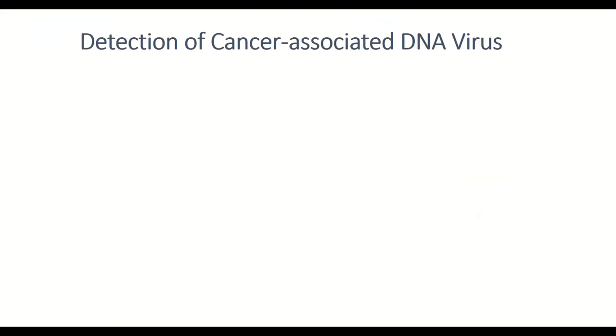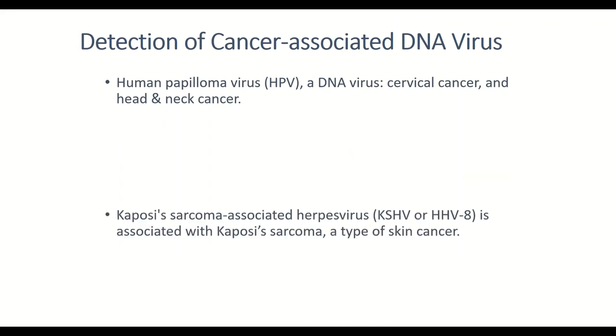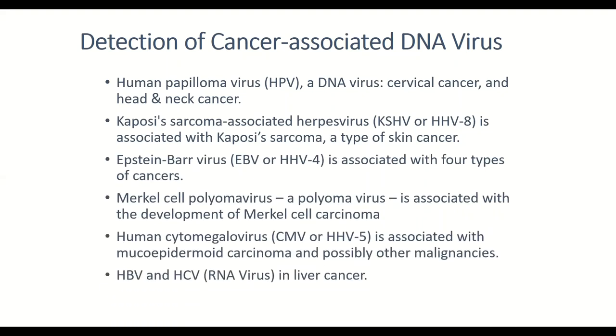And this is just the last part of my presentation. I'm just going to show the so-called virus detection, okay? Because we already knew the HPV virus causes cervical cancer, head and neck cancer. And there are other types of virus that cause tumors for other types of cancer, okay? So this is why it's very interesting to detect if there is a virus or not for a specific tumor sample.